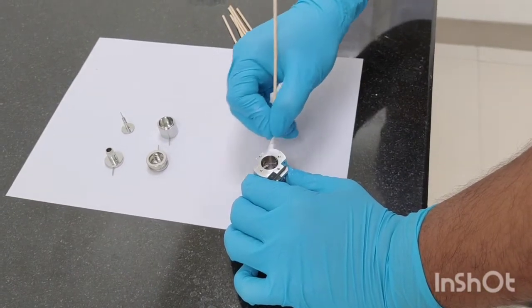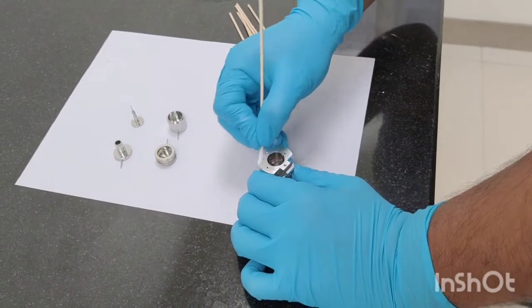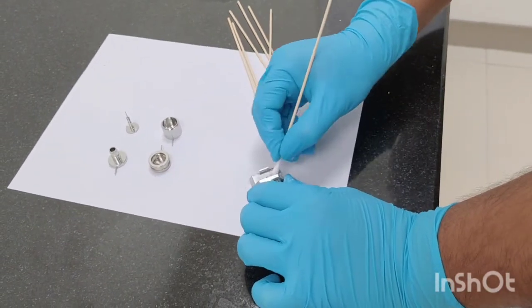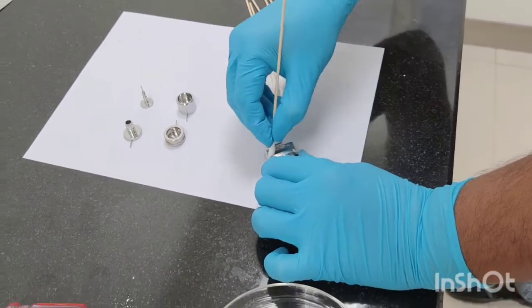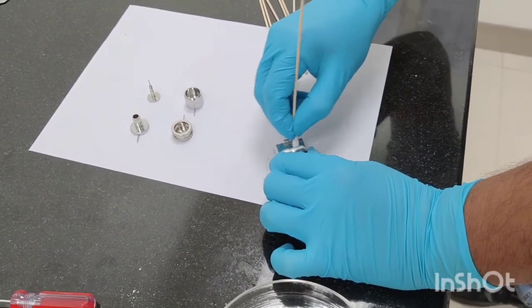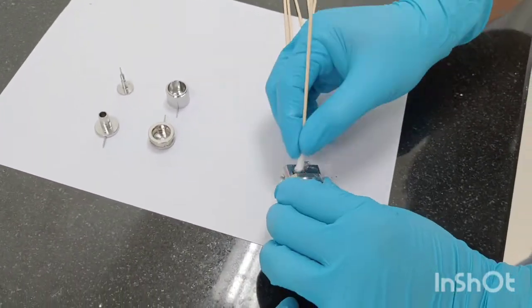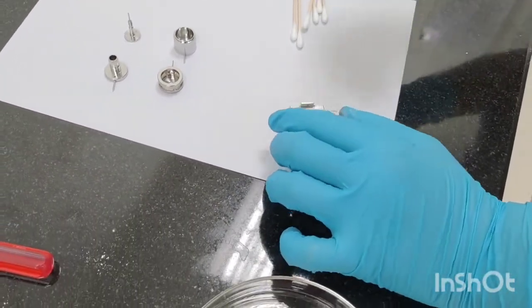Some contamination is not visible, so we need to clean all the parts properly when we are cleaning the ion source. You can see as I am rubbing this, the black color is disappearing.